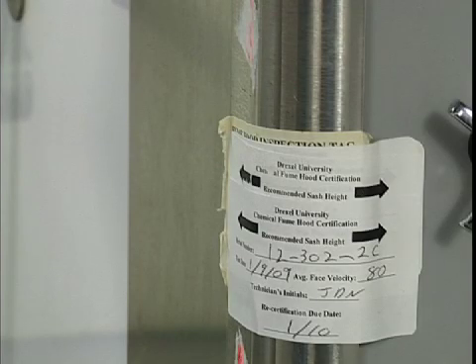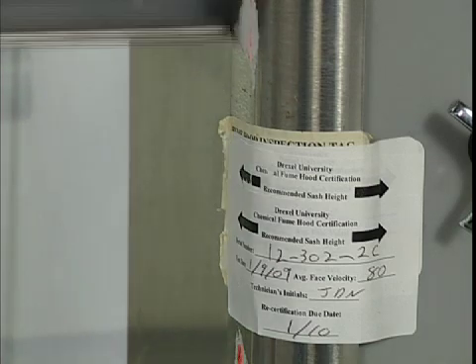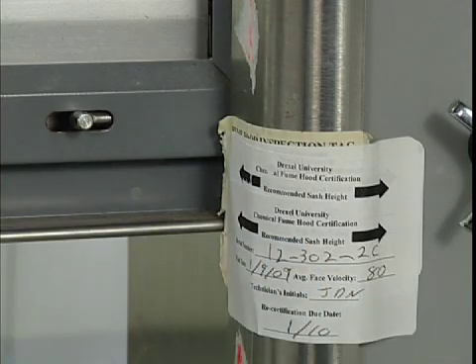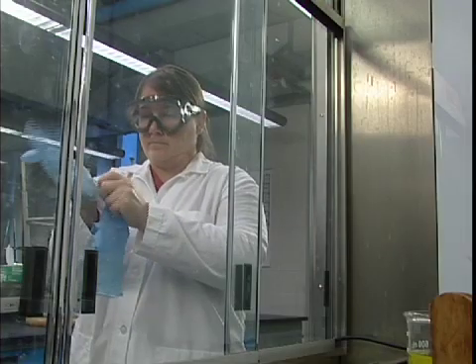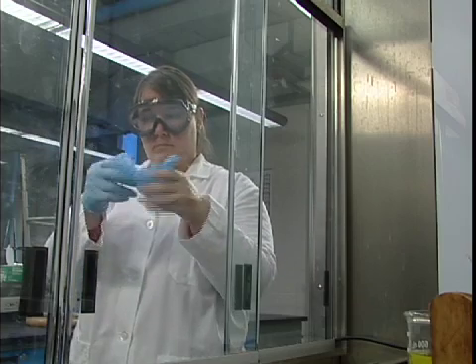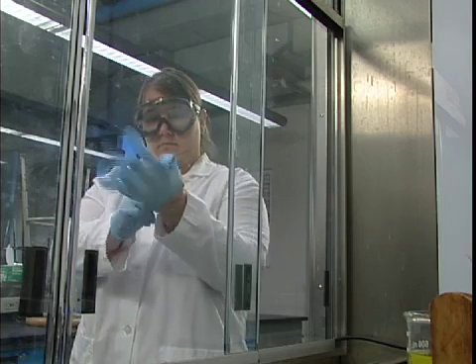Many hood manufacturers have determined the levels at which the sash in their hoods should be placed for maximum protection, so you'll want to follow their recommendations if at all possible. When working within a hood, don't forget to wear the personal protective equipment that the materials you're using call for.